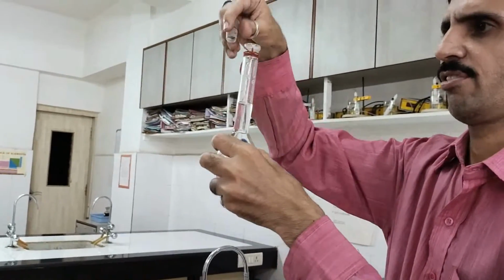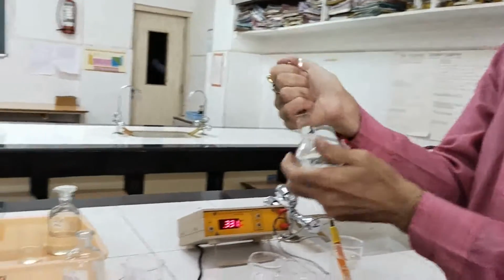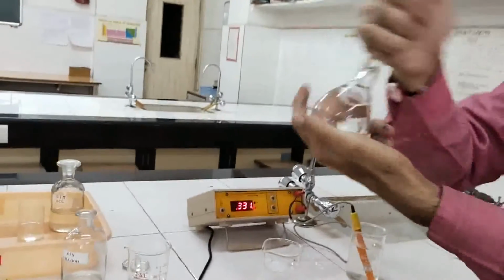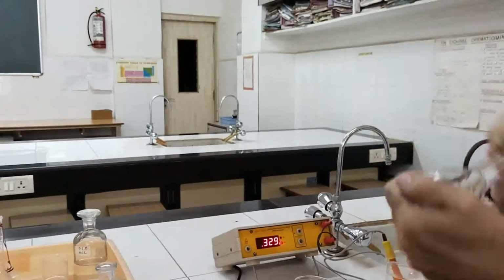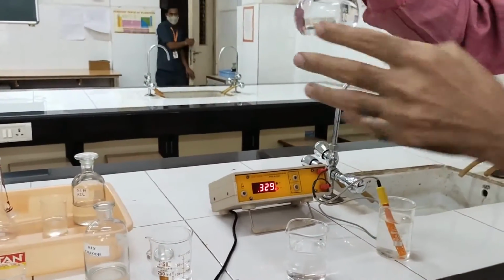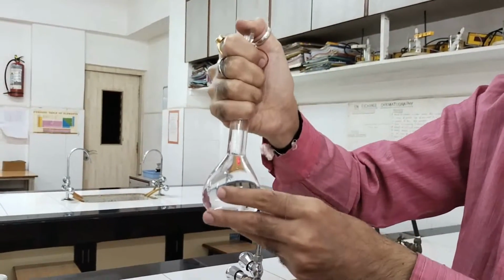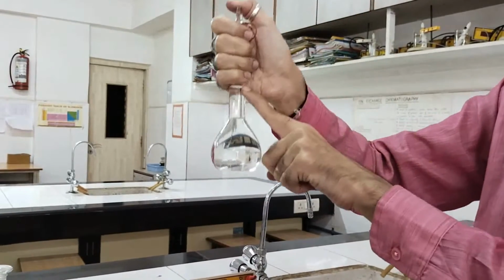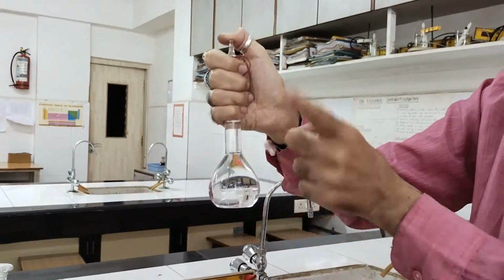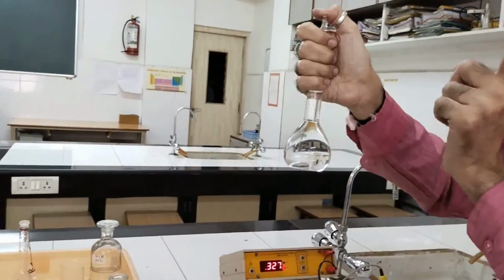Yes, so this is 100 ml. Now cork it and just make sure that the solution becomes uniform. So you just agitate the solution, mix the solution well. So now what I have done is I took 50 ml of 0.1 normal acetic acid. I diluted to 100 ml. So twice the dilution, so the concentration of this acetic acid becomes 0.05.